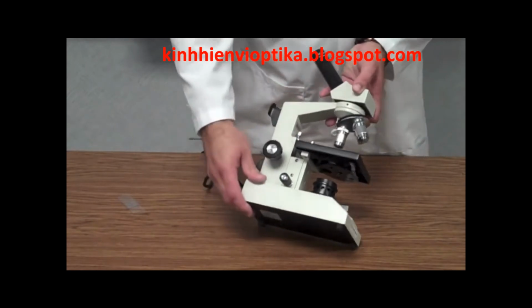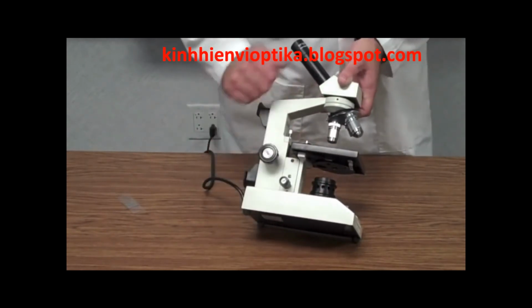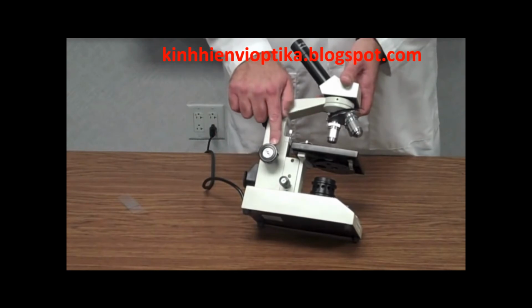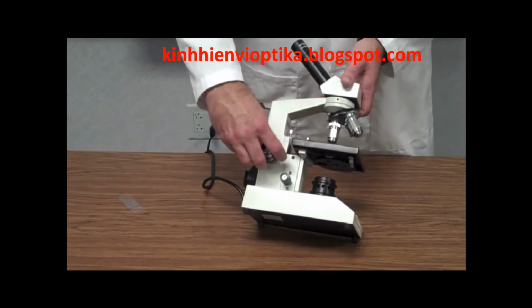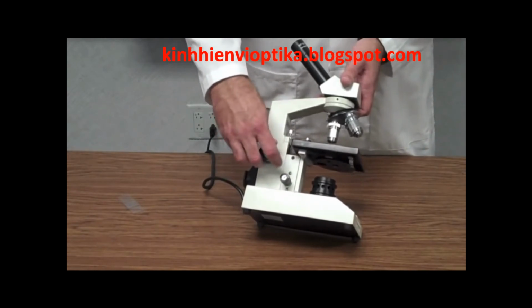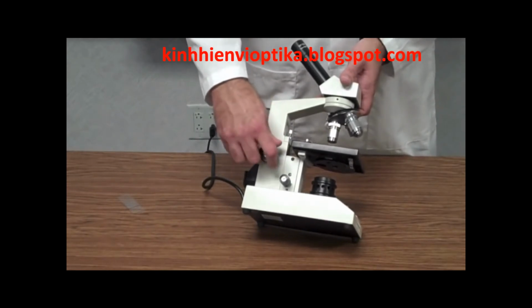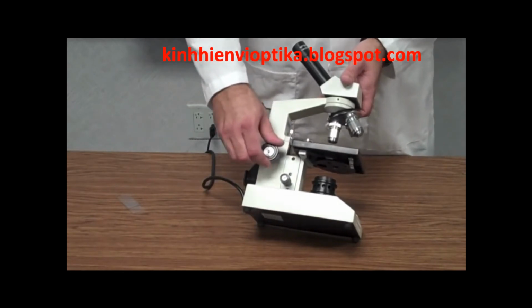Here at the bottom, we have the base. This right here is the base, obviously what the microscope sits on. This large knob right here is called the coarse adjustment knob. The coarse adjustment knob is used to make very large, very rough focusing adjustments. You will not get the image in real fine, sharp focus with this knob. It's just for moving the image quickly in and out of focus.